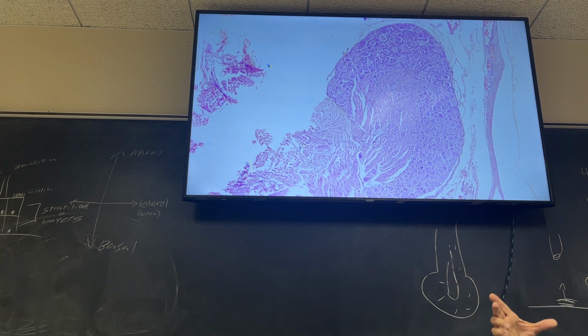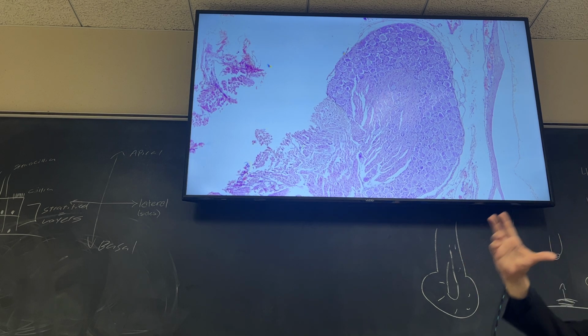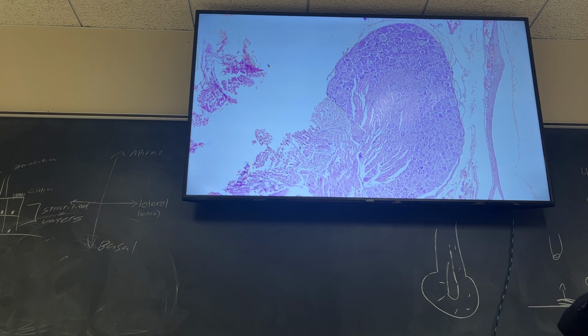And then you see these weird fibers running from the dorsal root ganglia into the central spinal cord, right? So notice that one goes on one end and one goes on the other end, right? One goes on the dorsal side, one goes on the ventral side. Do you know what those are? One's incoming, one's outgoing. One's an efferent, one's an afferent, right? Does that make sense?